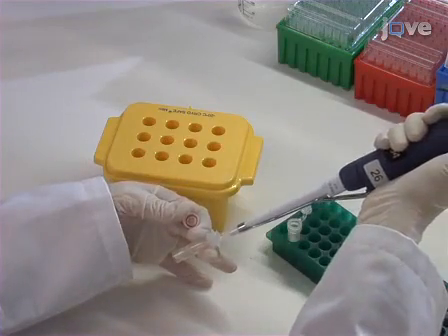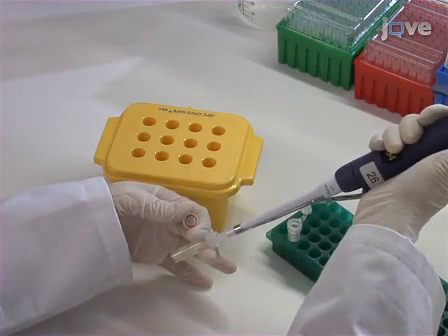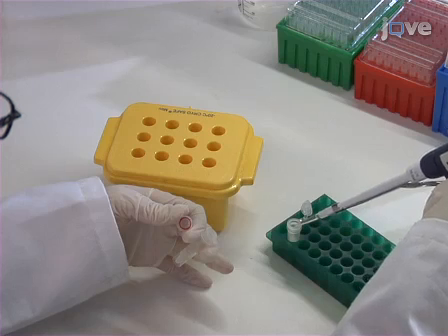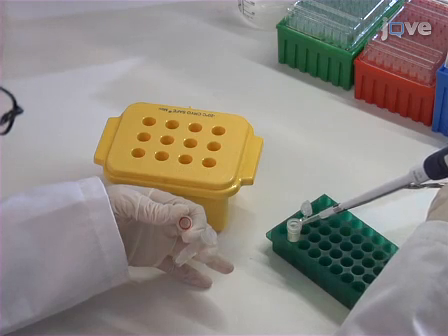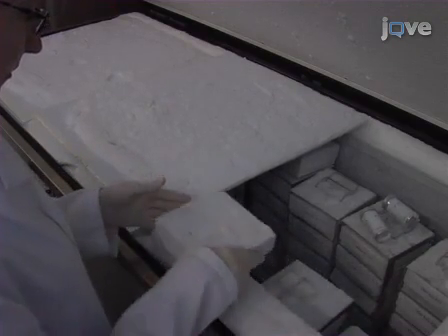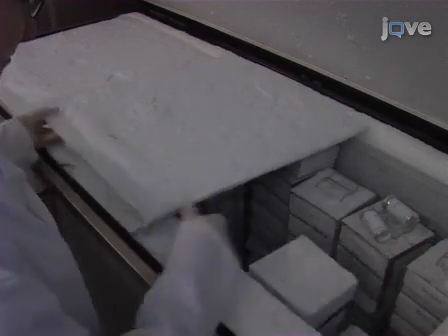Extract viral RNA from 200 microliters of viral isolate using a viral RNA extraction kit and the manufacturer's protocol. Elute 60 microliters of final volume and store extracts at minus 70 degrees Celsius or lower for later use.